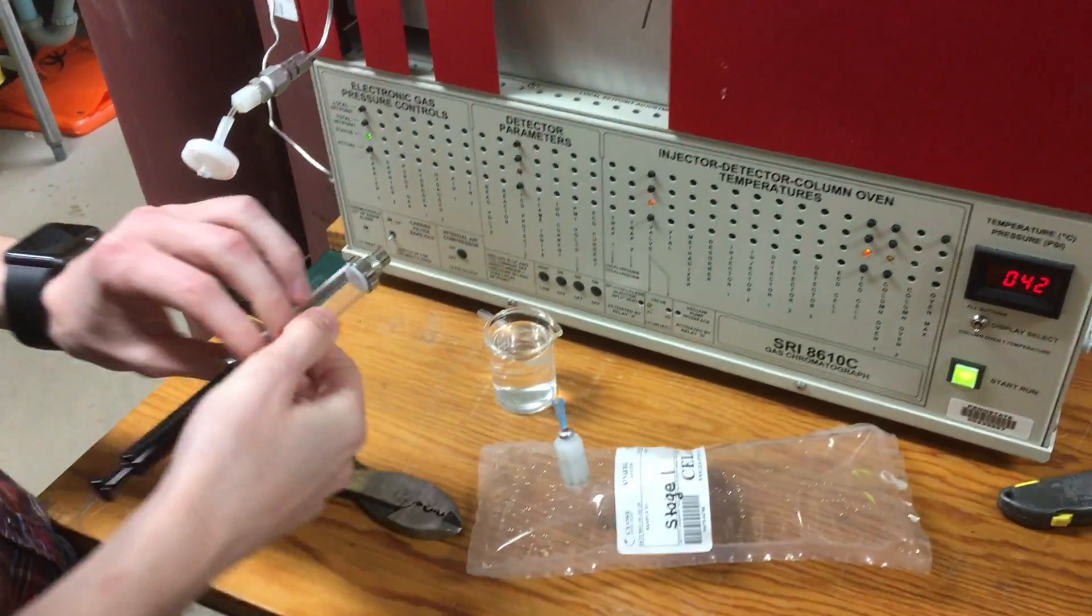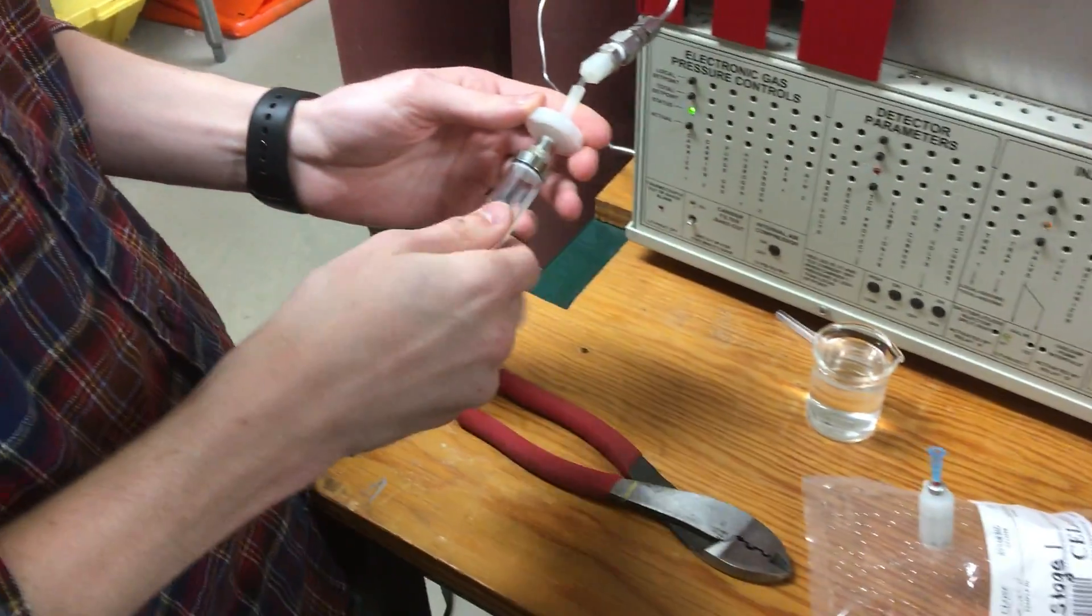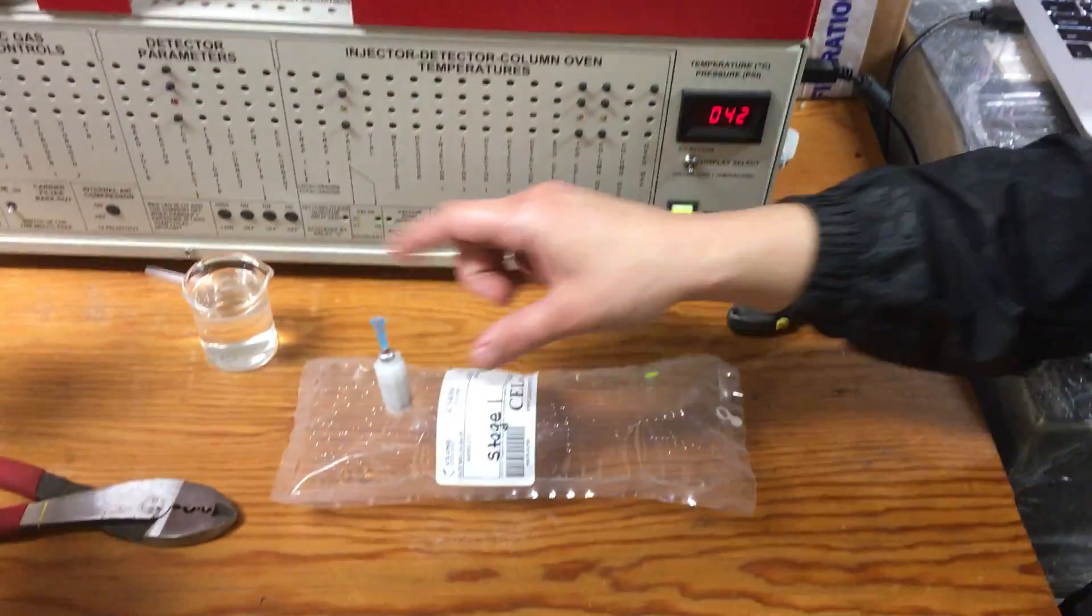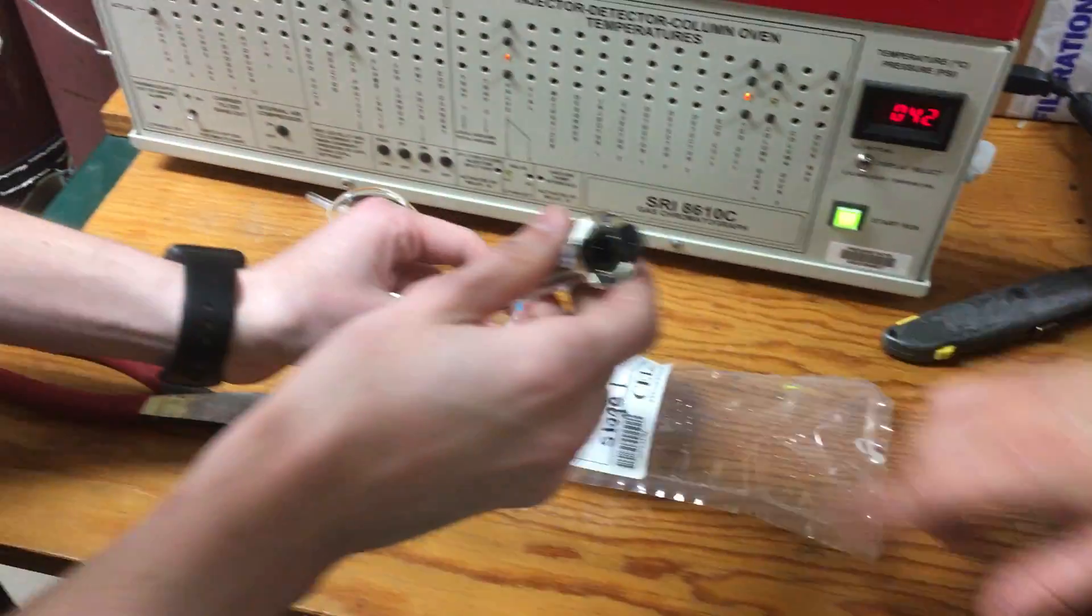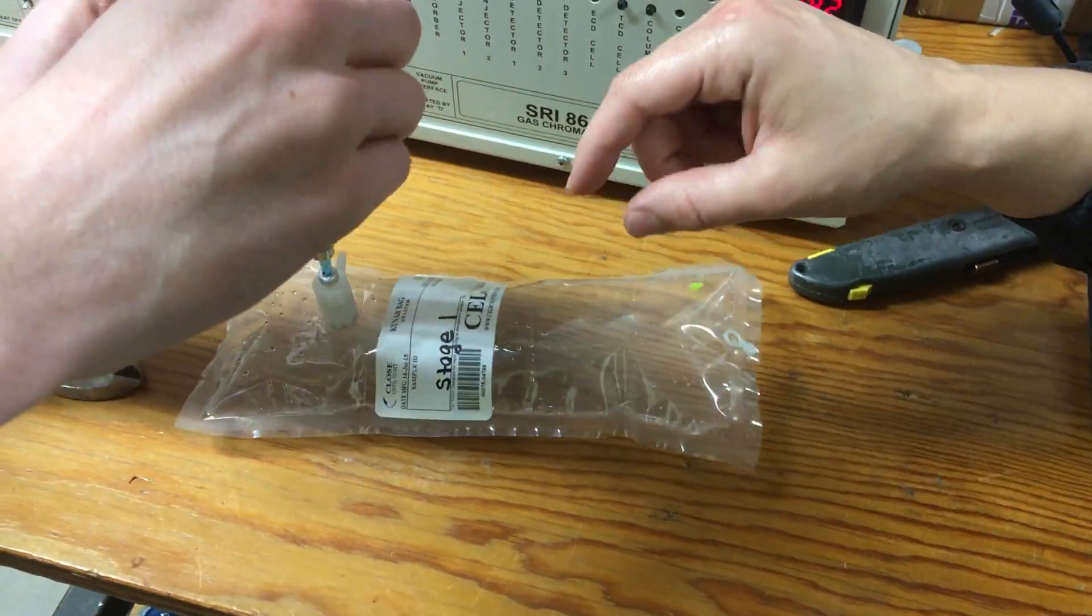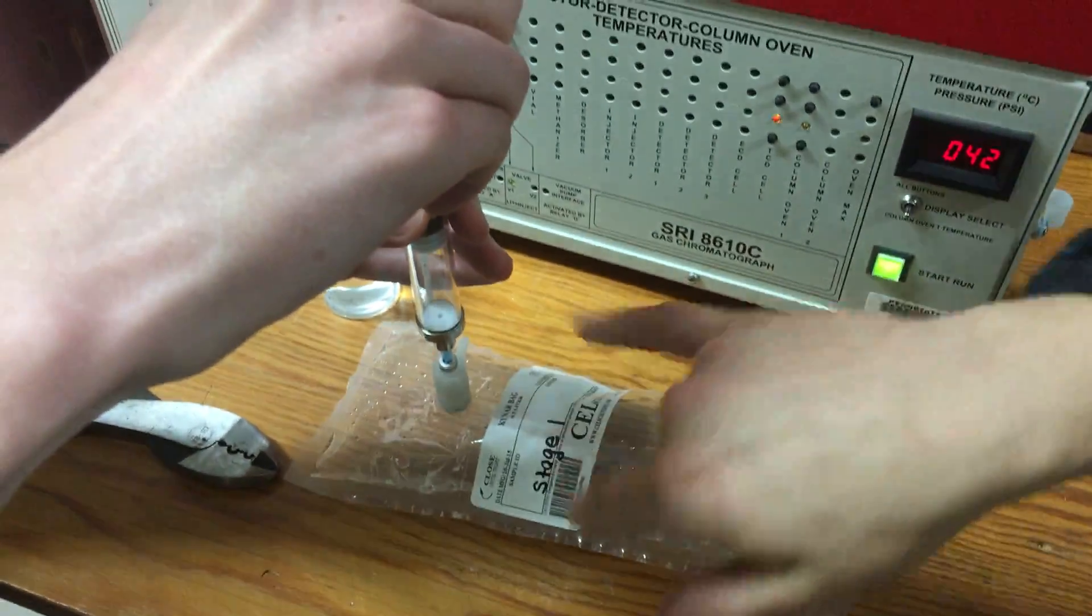Yeah, you're definitely purging it a couple times before putting in the actual sample. So what he means by that is he's pulling a sample from here. This is a gas collection bag - typically it should not have this amount of moisture in it. I won't go into details of that right now.